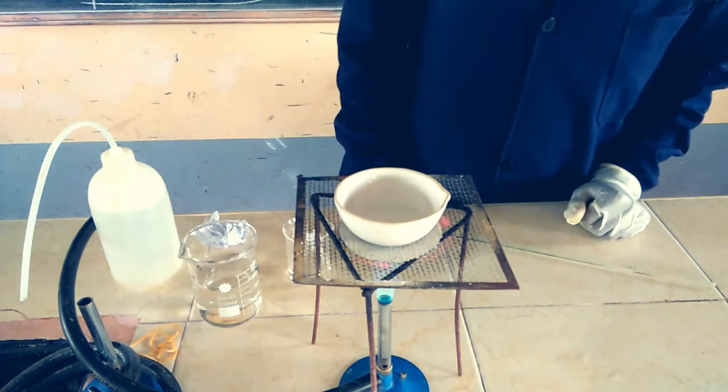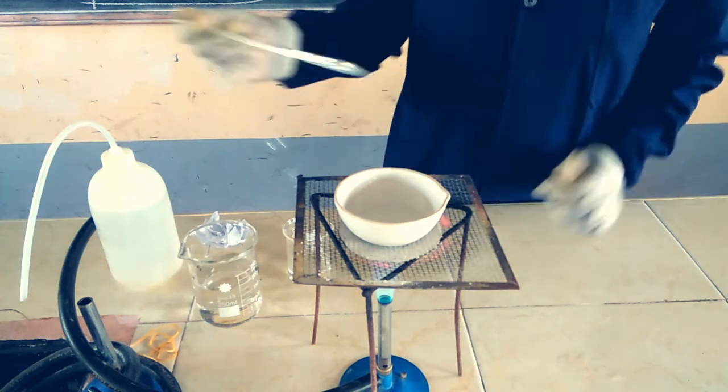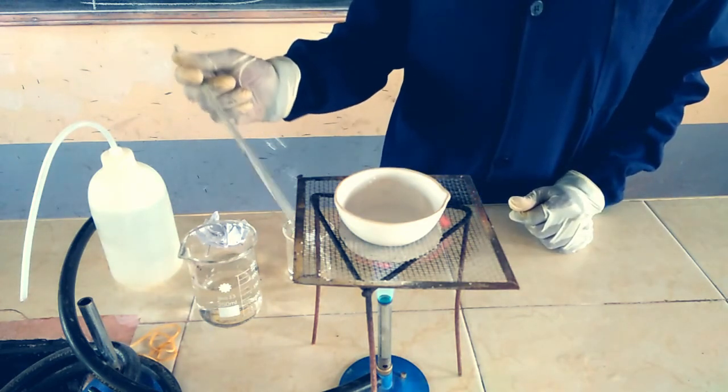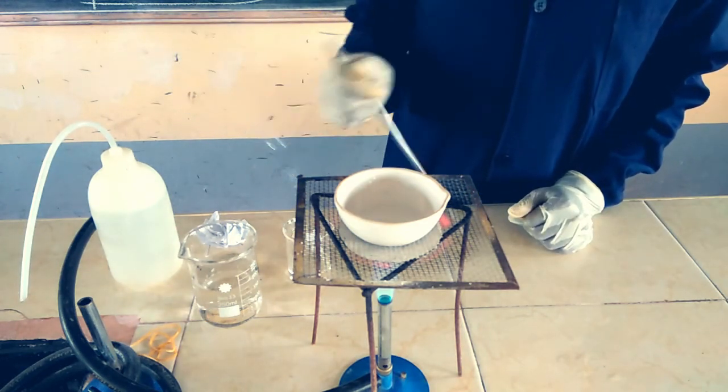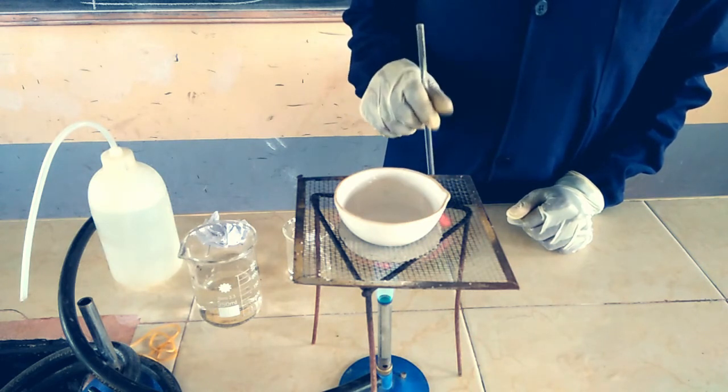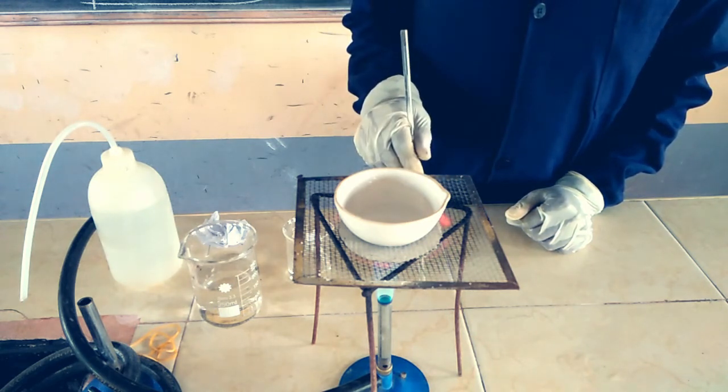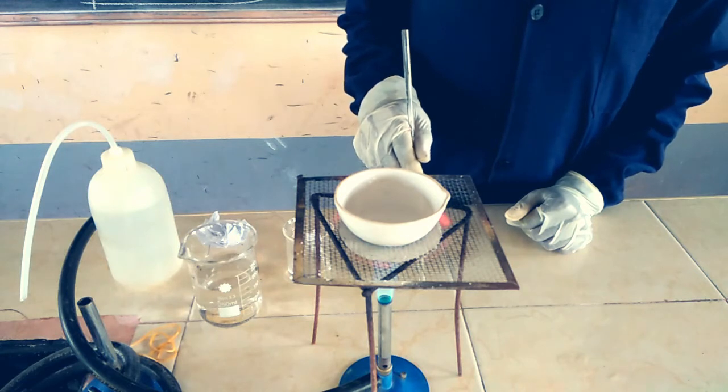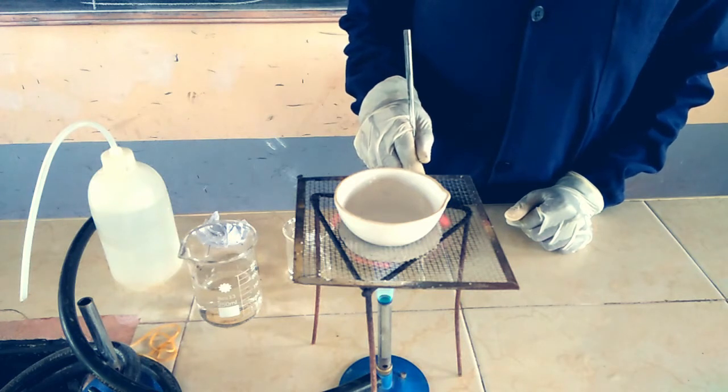We need to drive out all the water. As soon as you notice the water is driven out, the sodium chloride normally spits out of the evaporating basin. Once it starts spitting, we're supposed to transfer it onto a water bath so we can evaporate slowly to avoid the spitting.